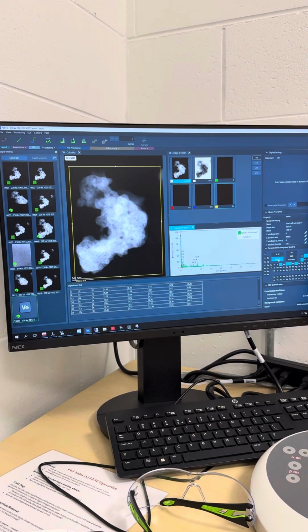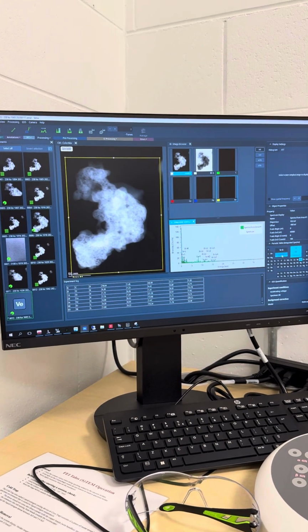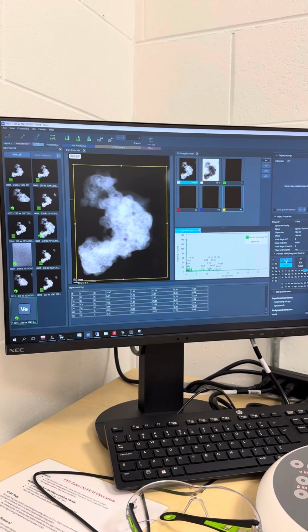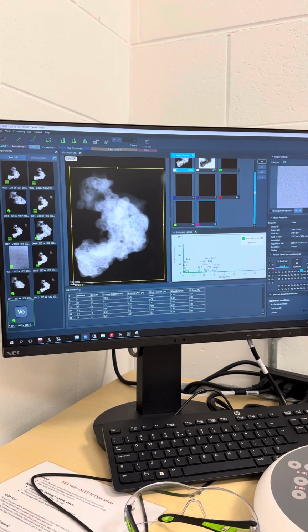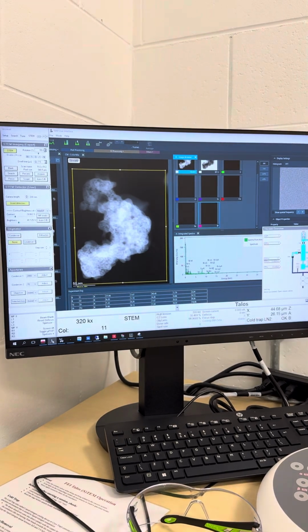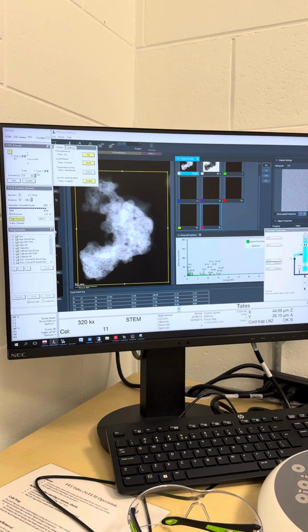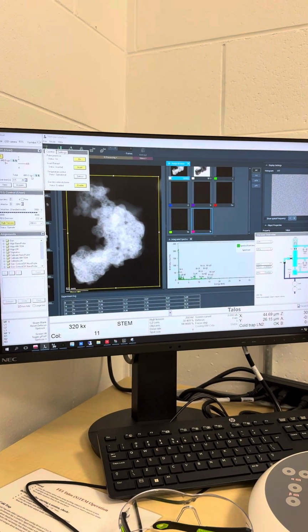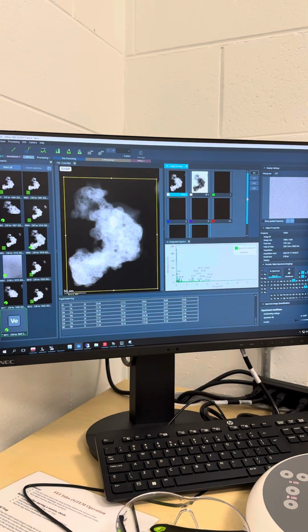And on the right here, you can pick the elements you want or select auto ID. And you can export all of those elements to SI. So that will make a map of all the elements. So to SI, you get a map there. Now, the biggest question is the count, the EDX count. So let's check. That's exactly what you want. You want something between 500 to 1K and above. So if we give this about 5 to 10 minutes, we should get a really good map.